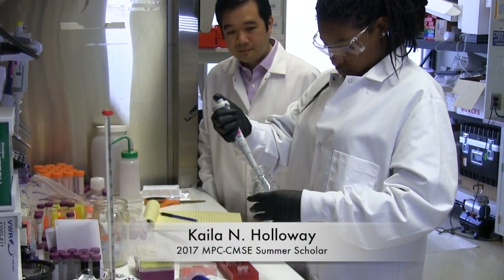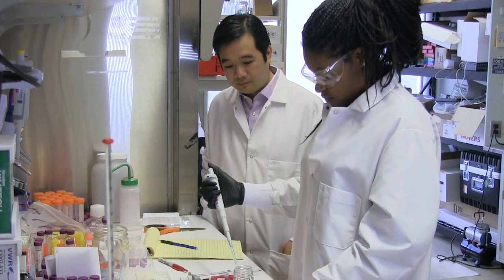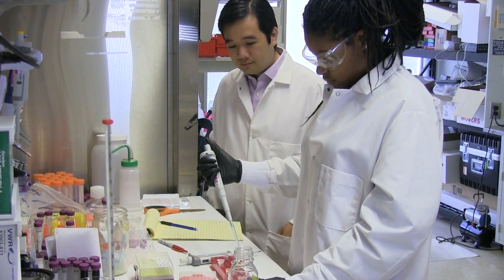I'm Kaila Holloway. I'm making nitric oxide and hydrogen peroxide sensors. So it's basically DNA wrapped single wall carbon nanotubes. I'm going to be detecting hydrogen peroxide and nitric oxide in different cells.